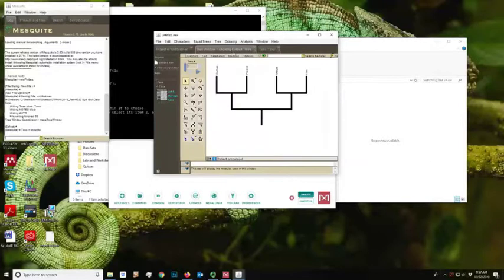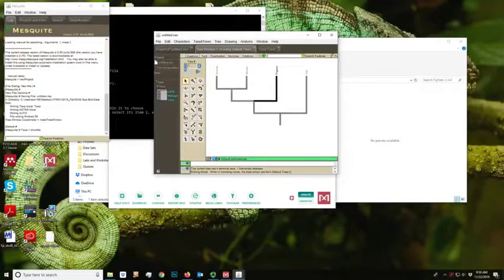Okay. So I come back to my tree view, and now one of the nice things about this program is you can manually edit the branches. So I can say, oh, I want my mouse more closely related to my human. So drag it over there, and it will connect them together. The pigeon is the next one, the fish is the next one. So that's the correct tree, but if it wasn't, I can make any sets of arrangements I want just by dragging these different branches to connect in at the different places.